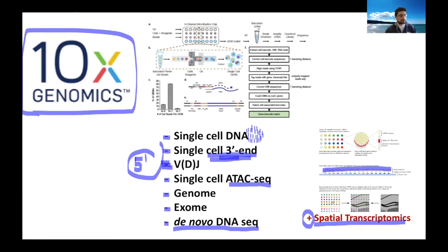The barcode is telling you that this position was exactly in this part of the tissue. So you're doing RNA-seq not only to measure the abundance in single cells, but also to understand where these cells were originally in the tissue layer that you extracted.